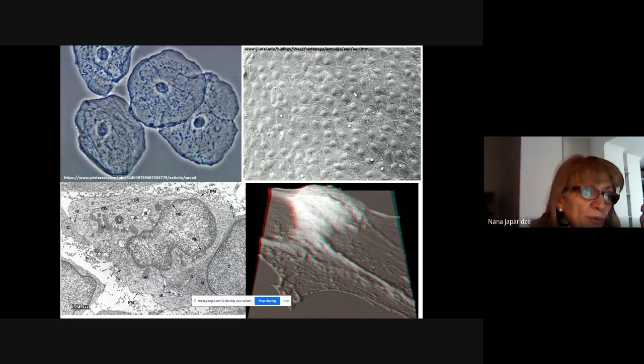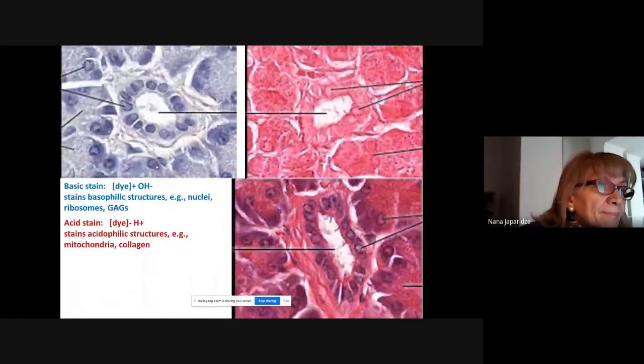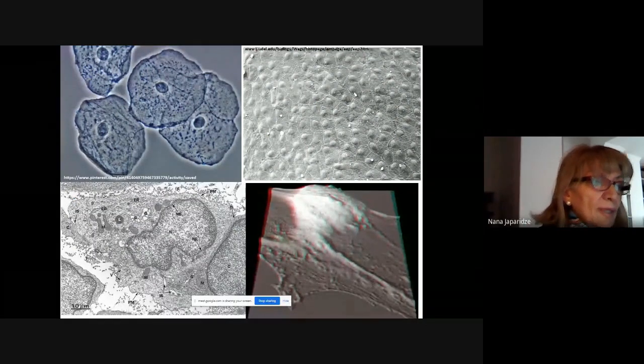You see the nucleus of the epithelial cell, and the nuclear envelope; in some places the two leaflets of the nuclear envelope are clearly identifiable.